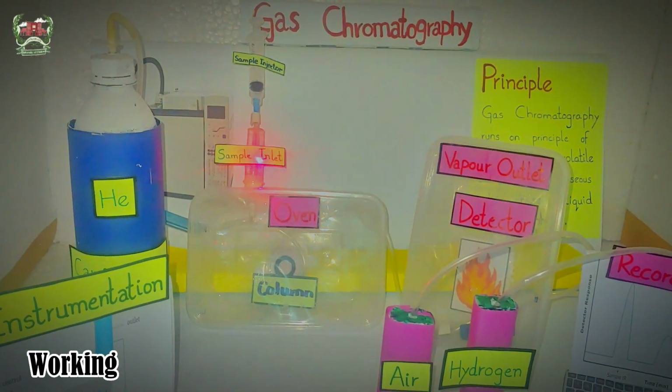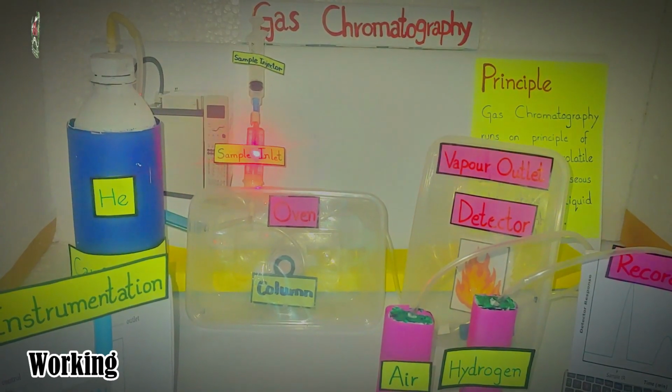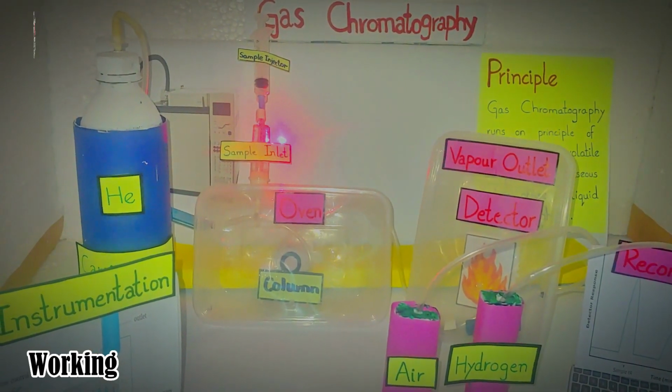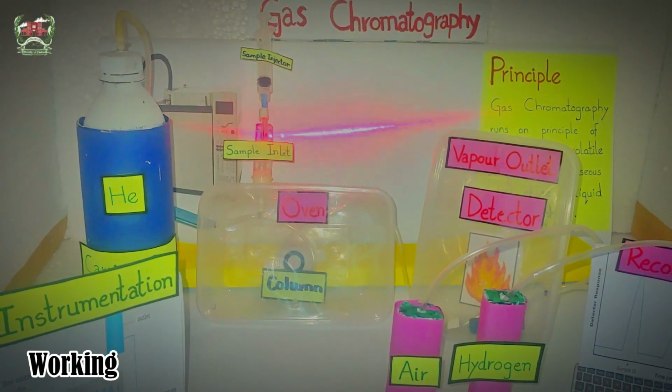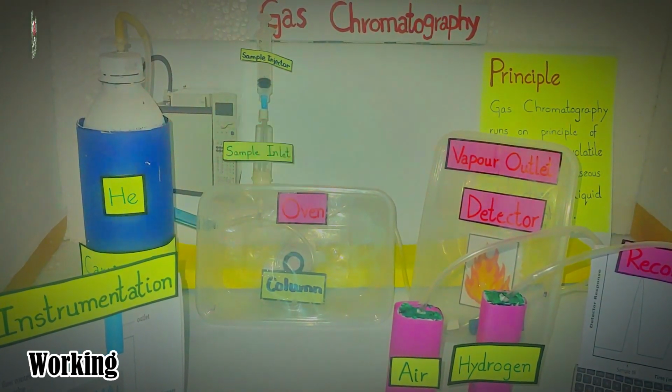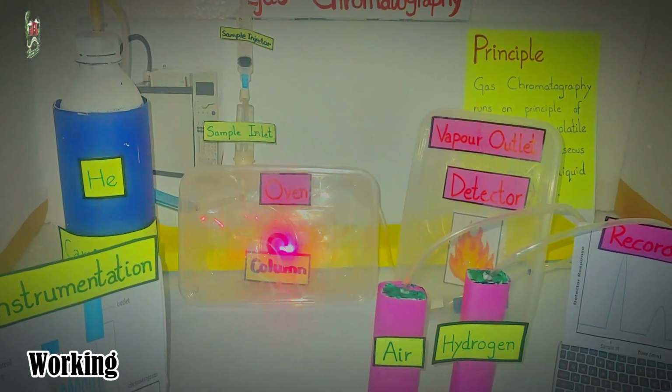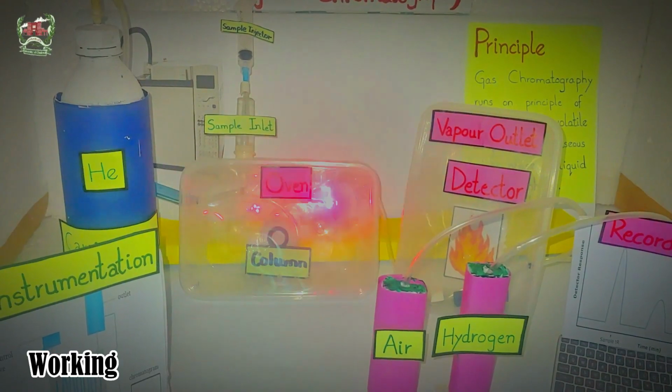If the sample is liquid, then it will be converted into gaseous form due to heat created by the metal block present in the sample inlet. Now the vaporized liquid sample will move toward the capillary column.